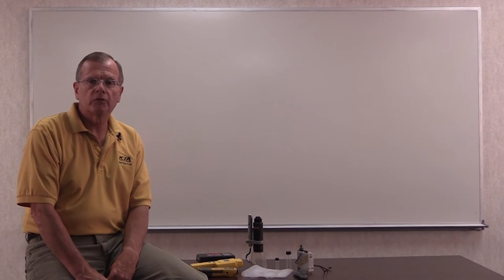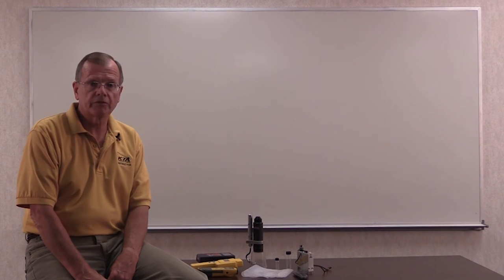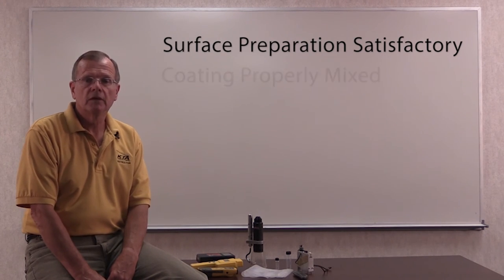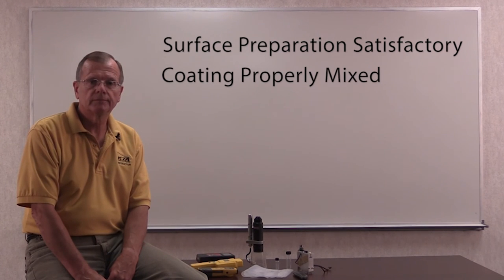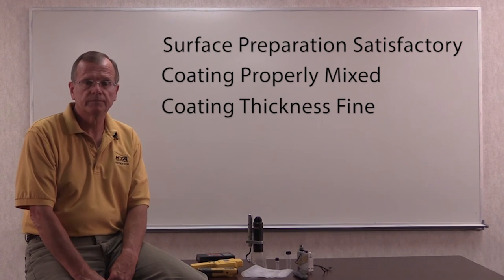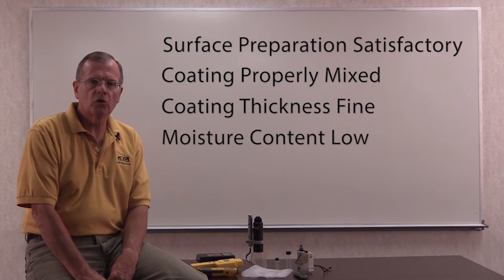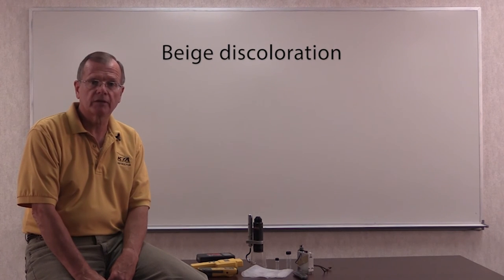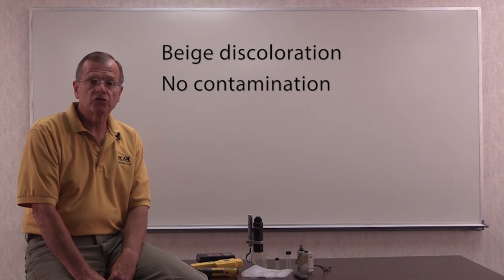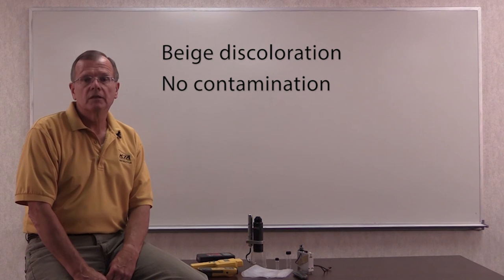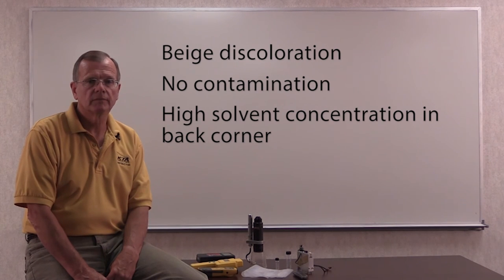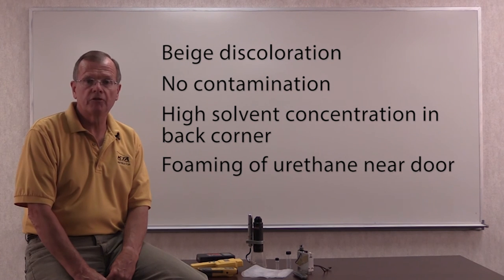The laboratory findings were provided to the field investigator who issued a report with the following observations. Preparation of the existing coating was satisfactory. The new coating was mixed properly. The thickness of the new coating was acceptable. The moisture content of the slab was low and was not a problem. The failure was between the clear urethane and the beige epoxy. A beige discoloration was present on the backside of the urethane. There was no contamination between coats. The failing samples from the back corner of the room contained high concentrations of solvents from the epoxy. The failing samples near the door exhibited foaming of the urethane.